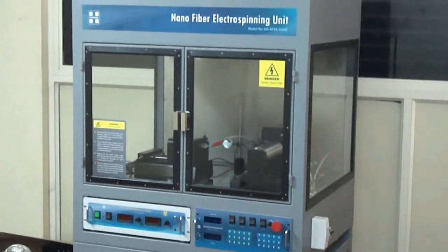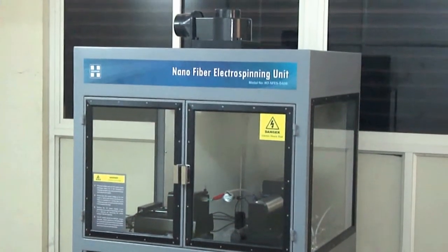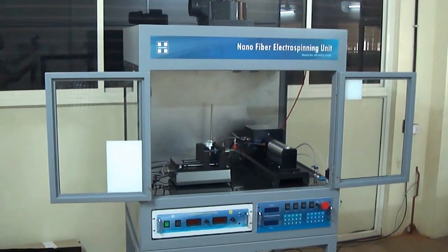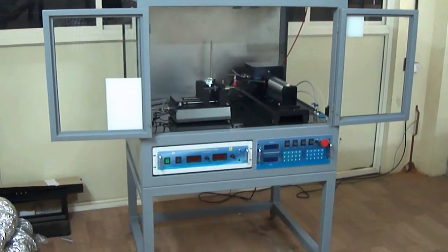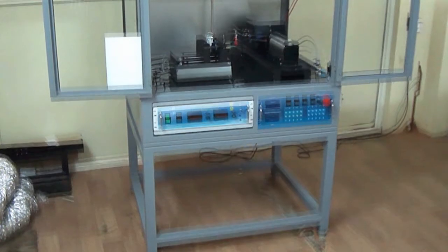The fume hood provides the compact unit an enclosed atmosphere, with three transparent side walls to monitor the electrospinning process. The hood also has features like exhaust fan, granite work surface, and optional features like high bright halogen lighting.